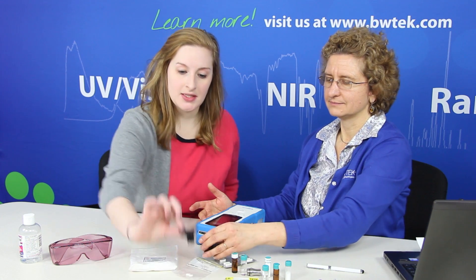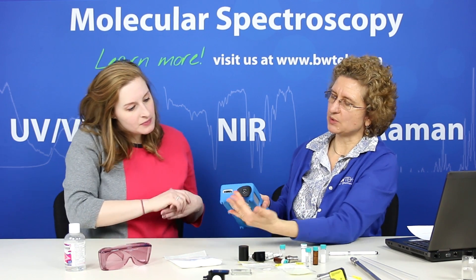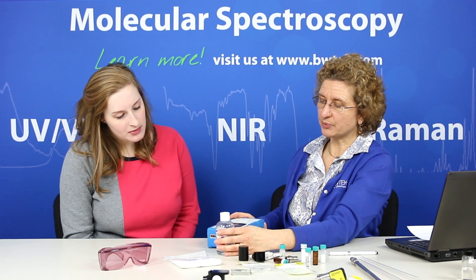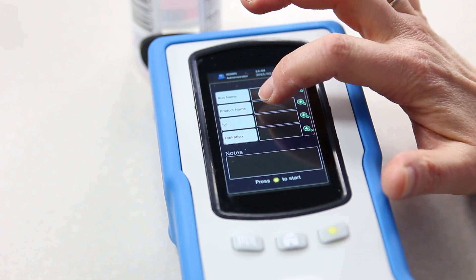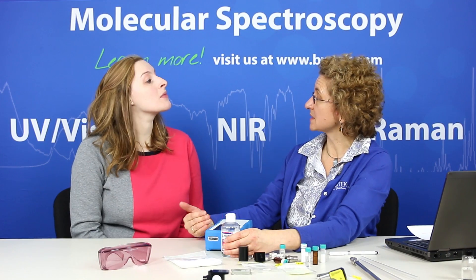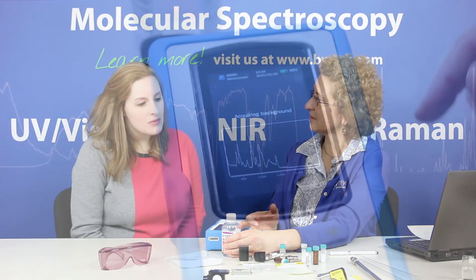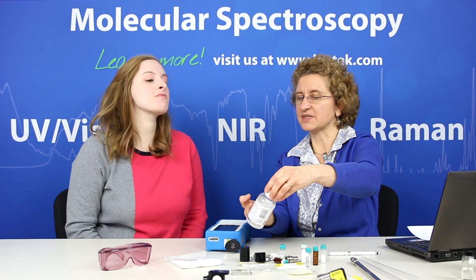How about this accessory — what is this one used for? That one is our bottle adapter. You can see it has a curved shape, so if you take that bottle — which happens to be glycerin in a plastic bottle — you can press this up against the bottle and again we're measuring through the packaging. We'll measure this as an unknown in investigation mode, give it a sample name, and it will scan the sample and search the libraries to find a close match, giving us a match or no-match result. The focal point is beyond the plastic bottle so we're actually measuring the sample inside. The library search returns a match result to glycerin, which is what the sample is.